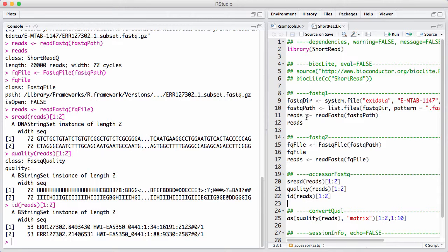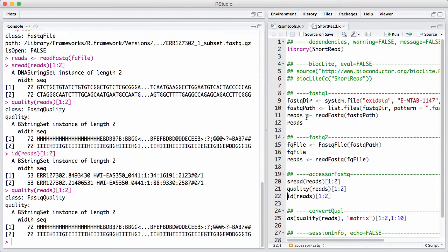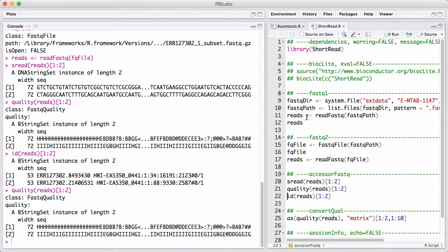So the quality values, as we saw before, is a BString set. It contains all kinds of weird characters, and they encode quality scores on something called the Phred scale. And before going into what the Phred scale represents, let's just say that quality values are integers between 0 and 40. And what happens is that different characters here correspond to different values. This is done for compression, in order to make the file size smaller. So in order to do any real computation on qualities, you have to convert them into integers so you can actually see what happens. And you can do that by coercing the quality scores into a matrix.